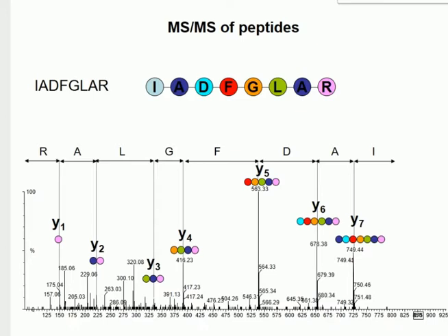Ask me again. Does it matter whether you're counting from the C terminus or the N terminus, or is it just arbitrary? Like here you've counted the Y, but would it matter? Well, okay, so I have counted the Y. The reason this particular peptide, and in fact most peptides that we're going to come across when it comes to proteomics, is that we use trypsin as the enzyme, so the resulting peptides have all got arginine or lysine at the C terminus, because that's where it cleaves.